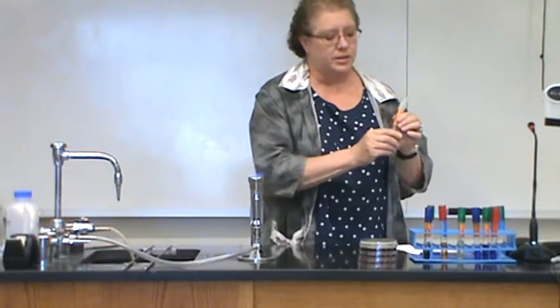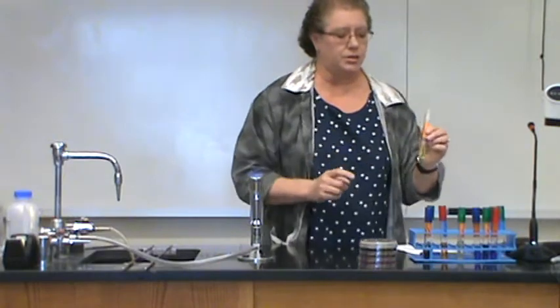Then, on the next page, is gelatin hydrolysis. We're using a gelatin deep tube, it's called. This is a gelatin media. It is the same color as a nutrient broth because it does contain the nutrient broth, and it also contains gelatin, just like you'd see in Jell-O. So it's a semi-solid media, just like Jell-O is kind of semi-solid. You're going to make sure you label a gelatin, your unknown number.